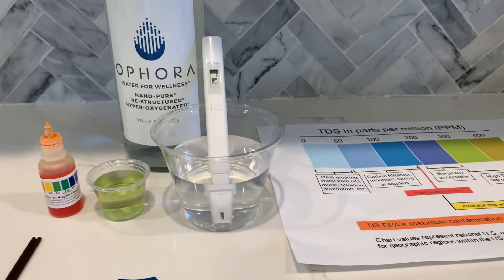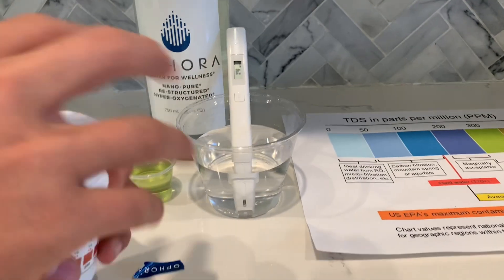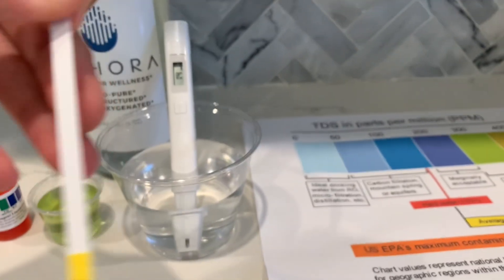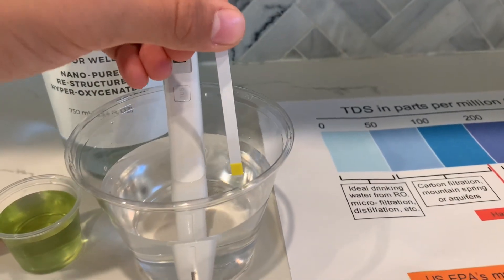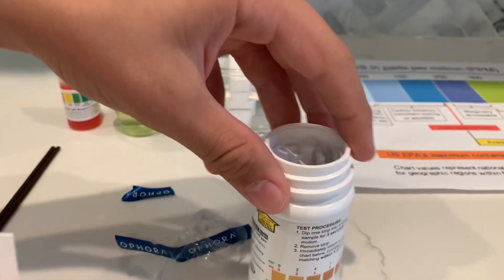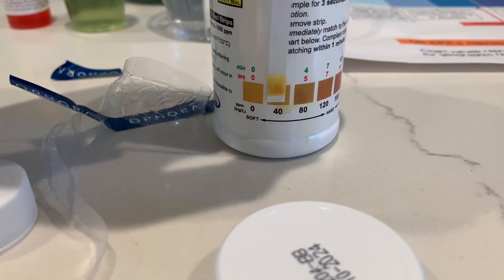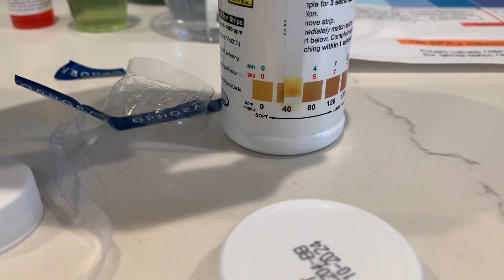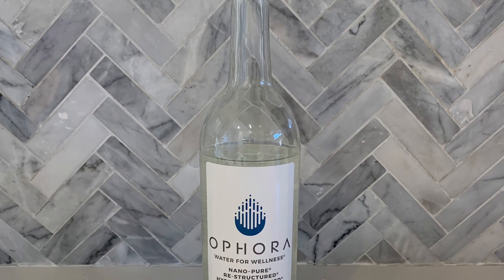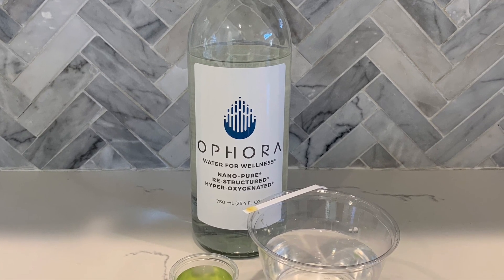Now, let's test the total hardness of the water. We will be using the Waterworks Total Hardness Tester. Let's take out one strip. Let's put it in the water for three seconds without motion. Now, let's compare it to the chart. This is around 40, which is soft water.